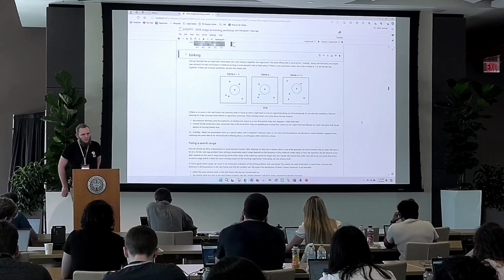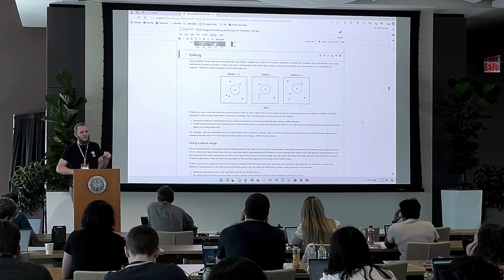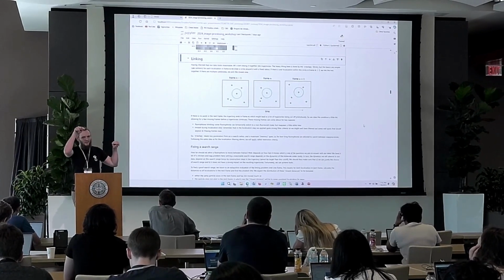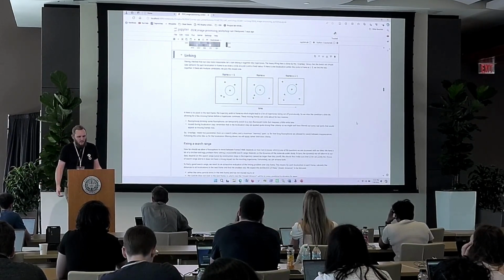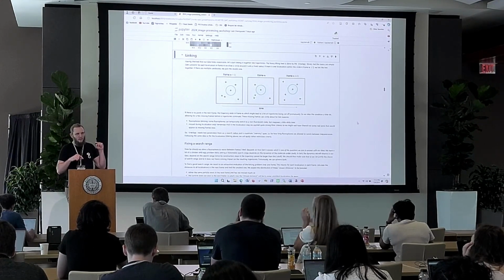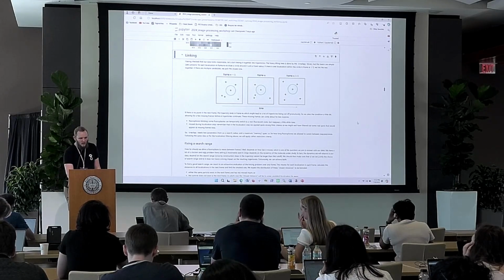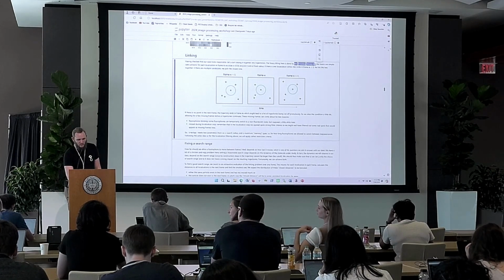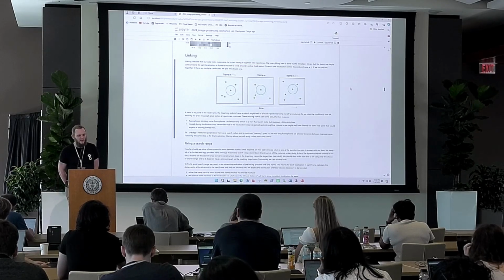So the problem we're facing is that Thunderstorm doesn't give us trajectories, right? It doesn't tell us particle 1 is at this point in one frame and at this point in the next frame. It just gives us localizations in individual frames that have nothing to do with each other. And now we have to do this linking together, identifying which localization in which frame belongs to the same particle. We're going to do this using the TrackPy library. So at the end of the day, this is going to be essentially one library call. But of course, it's important to understand what's happening behind the scenes.